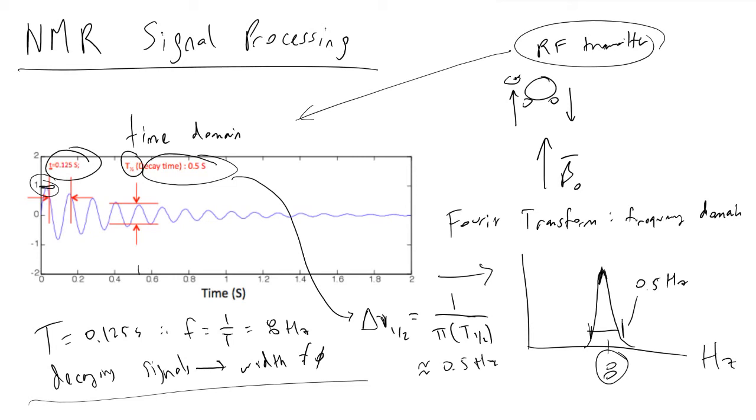And so I thought this would be a nice introduction as to the way we're able to process NMR data and actually use it in practice, so we can see chemical properties and analyze new molecules and deduce the structures of unknown compounds. And so it is pretty interesting stuff.